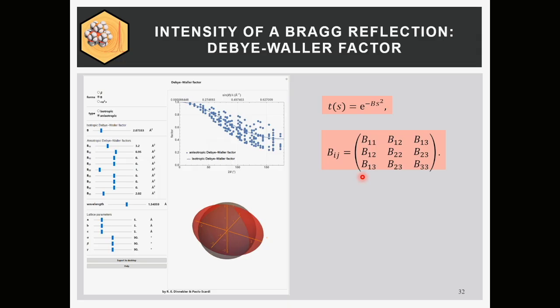Usually, and in particular for quantitative phase analysis, if you start refining the Debye-Waller factors, it always ends up in a catastrophe, because you get a much nicer fit, a great difference curve, but your quantification is nuts. As long as you're not in the range, let's say, of B of 0.5 to 0.8 or something like that.